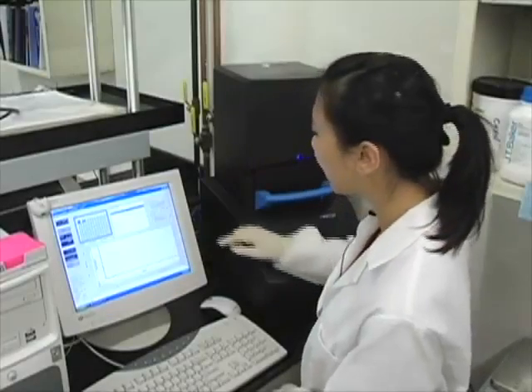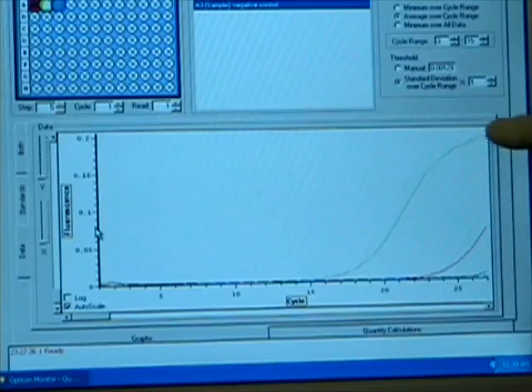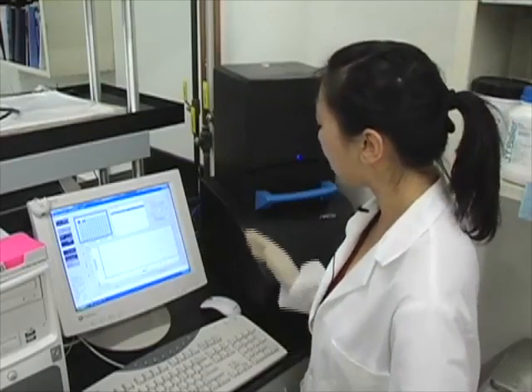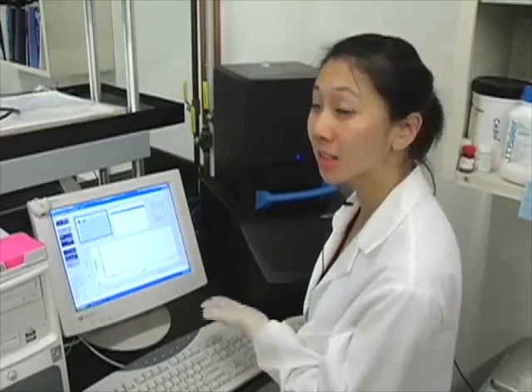So we can already see that our positive control has already come up, and it looks like our sample is also positive. As you see, it's starting to come up a little bit after our positive control. We're still going to have to wait it out because it's only at 27 cycles, but hopefully in a couple more cycles we can be sure that our sample is positive, and I can then proceed with my experiment.